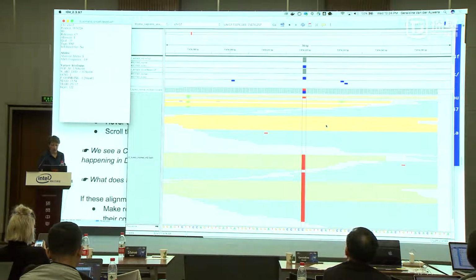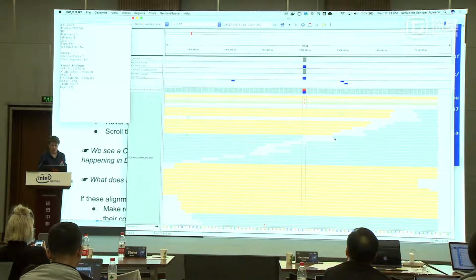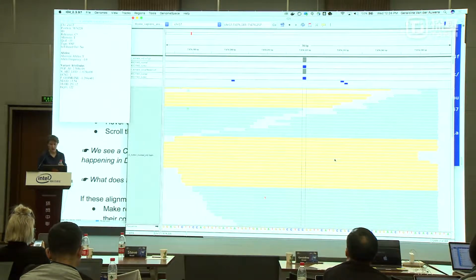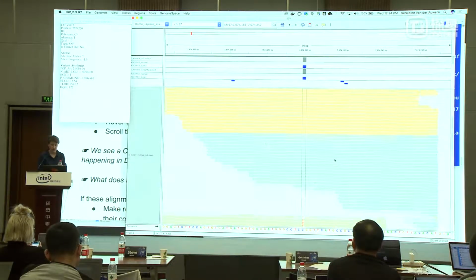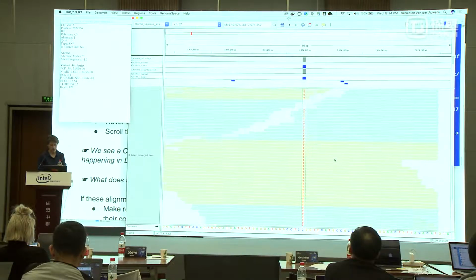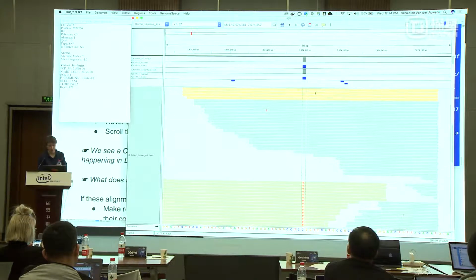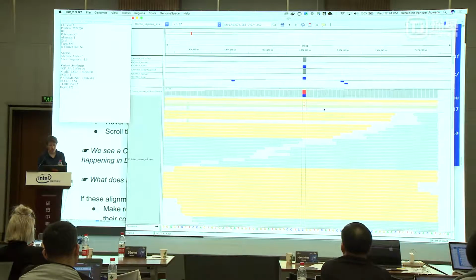And if I look at it, actually, I'm going to unsquish, expand. If I look at my normal BAM file, there's no evidence of variation in the normal. And in the tumor, all of my reads are variant, which, to be frank, I find kind of weird. But this is a very striking difference.